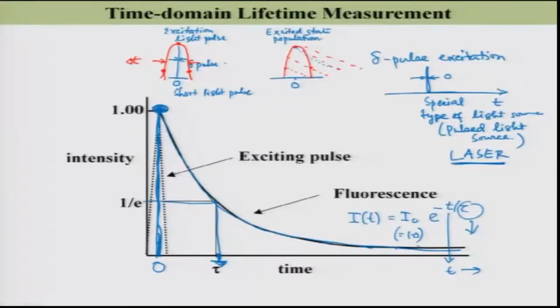However, the lifetime, you know, is in the order of nanoseconds, that we have discussed. That means for such a nanosecond lifetime, if we start with intensity 1, then that intensity is going to be 0 in about 5 times tau, right. So, 5 nanoseconds.